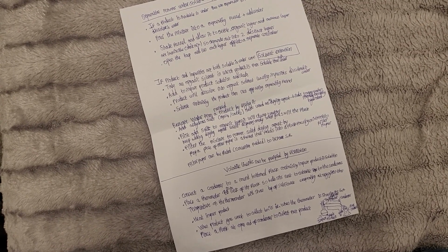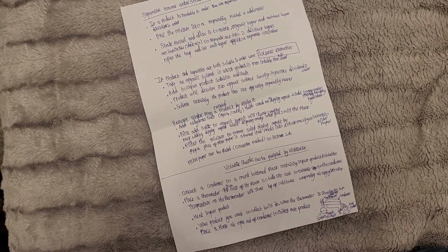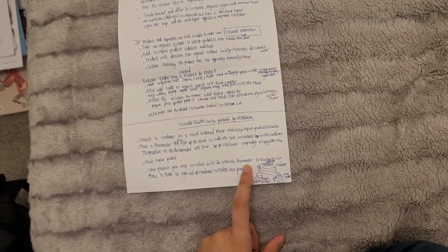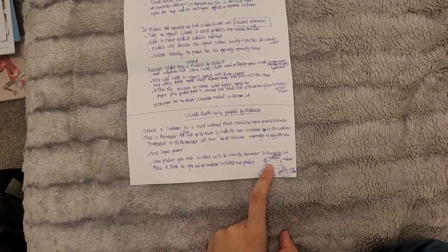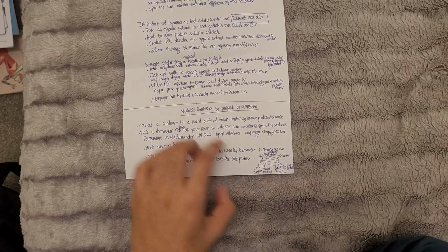Heat the impure product. When the product you want to collect boils, i.e. when the thermometer is showing its boiling point, place a flask at the open end of the condenser and collect the pure product. And this is the equipment, like your diagram. So you've got heat, your impure product, your condenser, thermometer, water out, water in, and then your pure product.